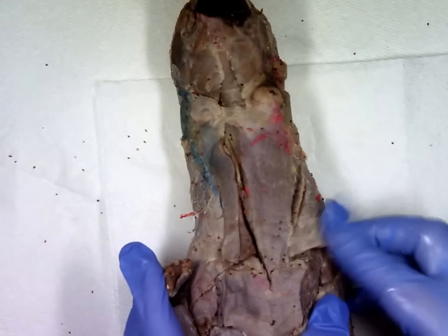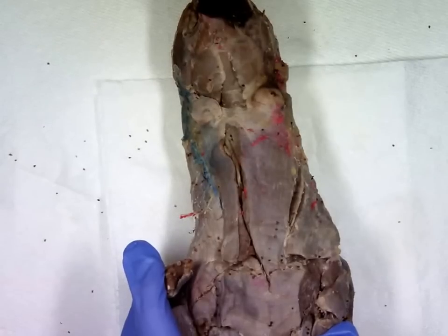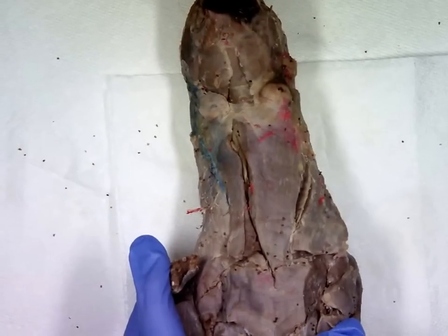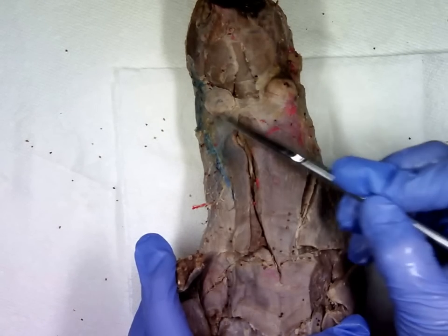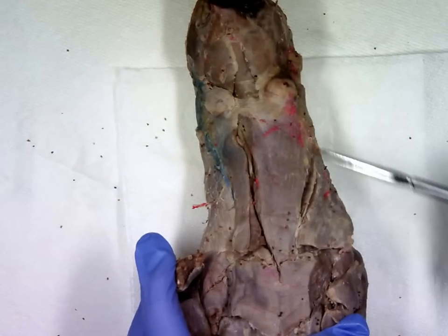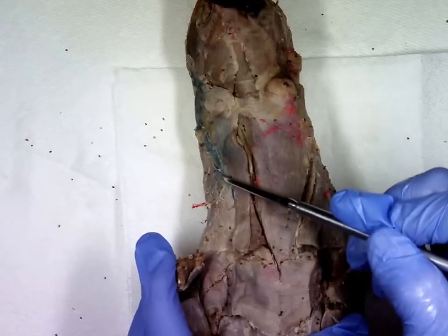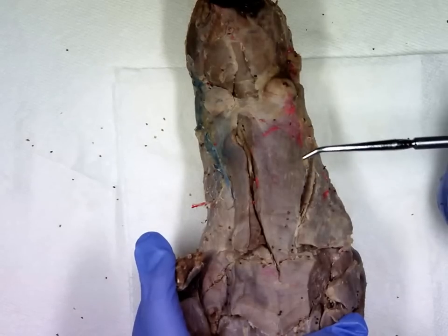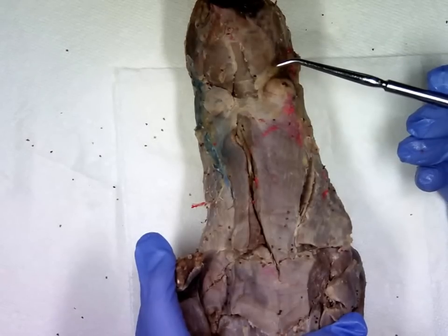In preparation for your mink practical exam, we're going to review muscle groups one through four. We'll start with muscle group number one. There are two landmarks: the first are these hard round structures called the mandibular glands, and along each side of the neck you have the external jugular vein. We can find the other muscles of muscle group one in relationship to those two landmarks.